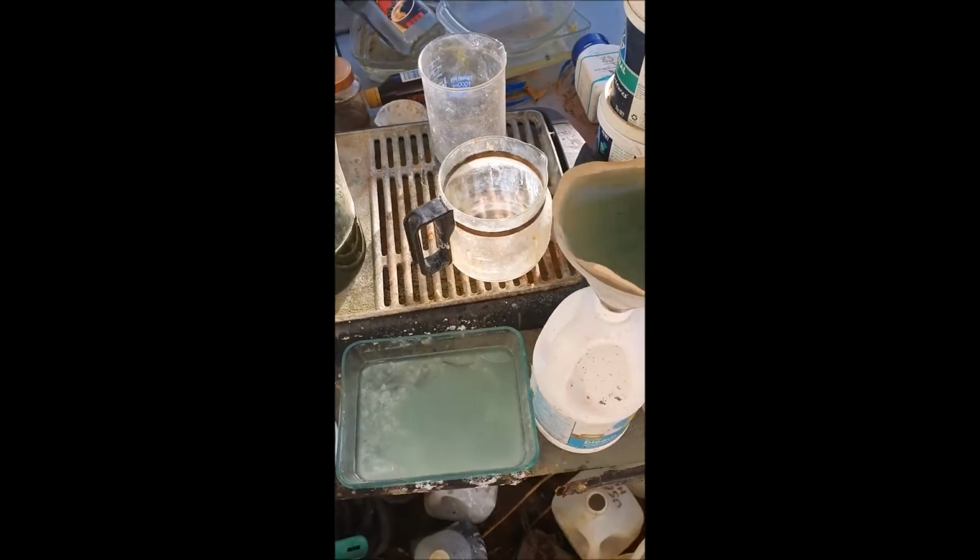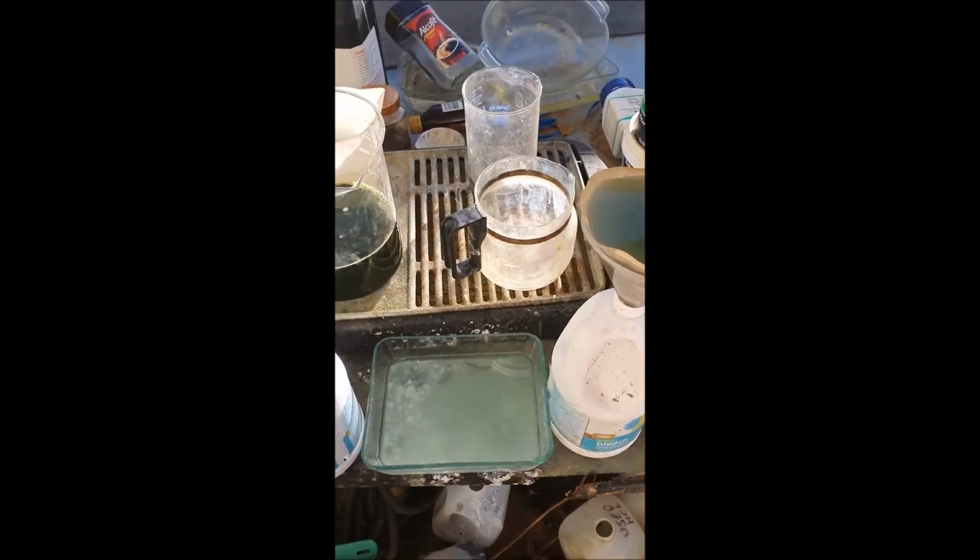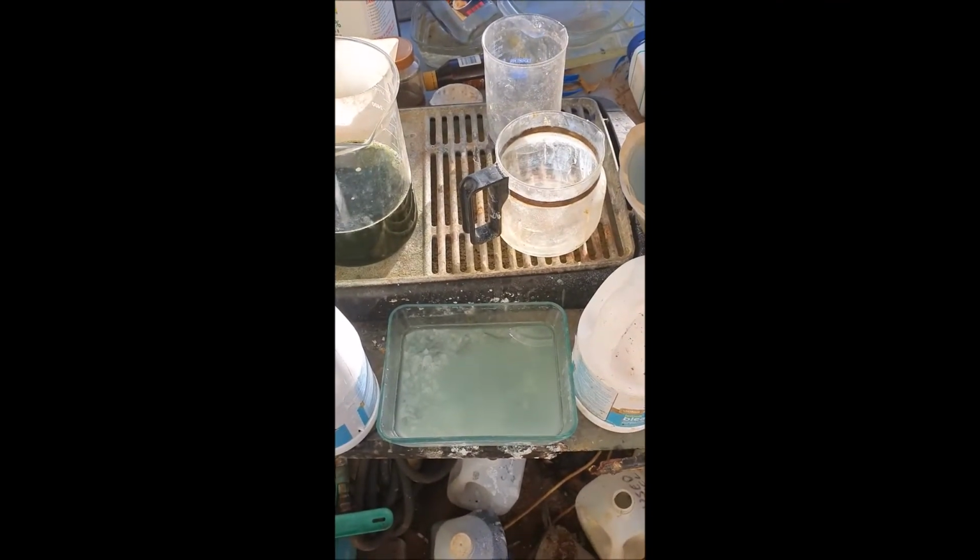I might put some more hydrochloric acid in later if I need to, but there looks like there's plenty there, because all that cotton balls will just reduce down, and we'll see how this goes. Well, I'm pretty excited, folks, because it's almost time for the big reveal.